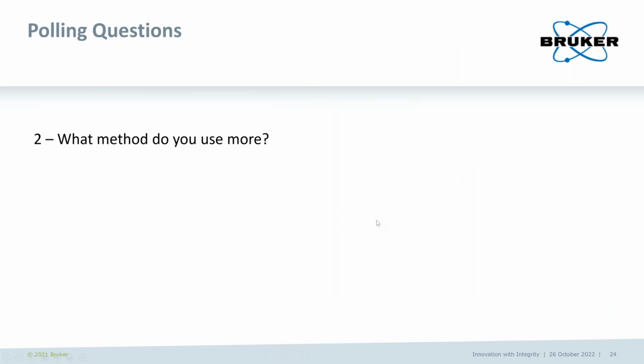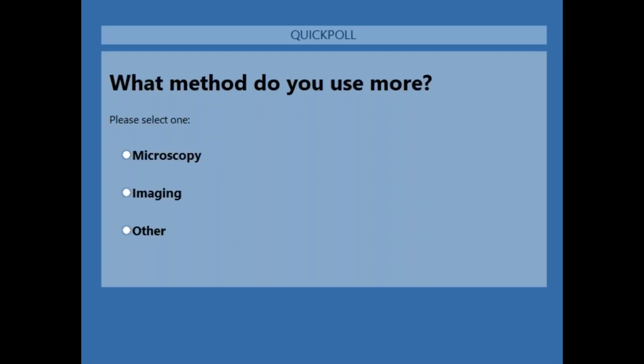So with having covered microplastics, let's go back to Lauren for our second polling question. Awesome. Next question up is, what method do you use more? Select the best answer. Is it microscopy, imaging, or maybe something different, other? If it's other, feel free to include that in the chat, just so we can start seeing what other methods people use. But select the best answer, what most applies to you.